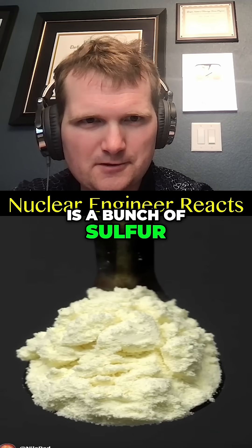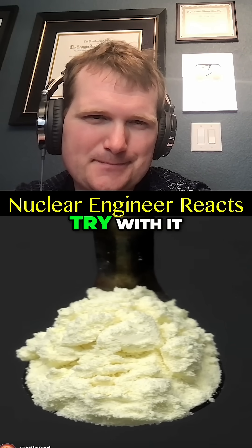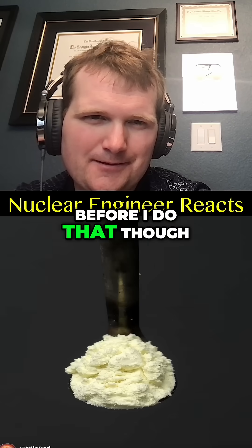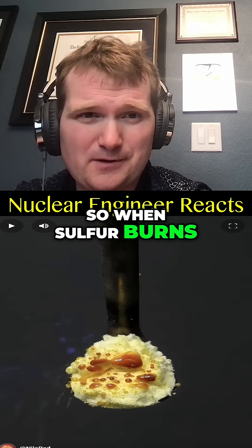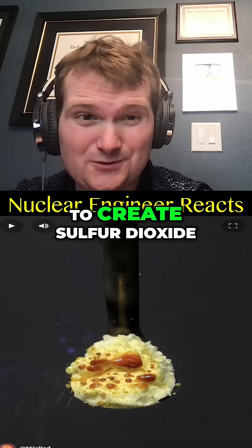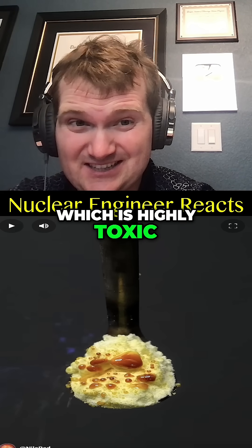What I have here is a bunch of sulfur, and there's something I've been really wanting to try with it. Before I do that, though, I first have to blast it with a blowtorch. When sulfur burns, it reacts with oxygen to create sulfur dioxide, which is highly toxic.